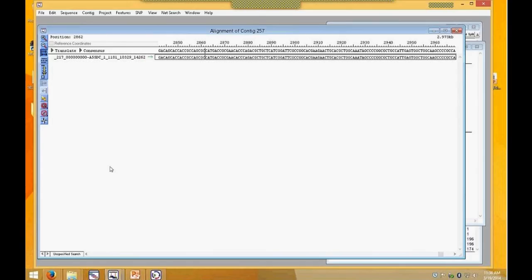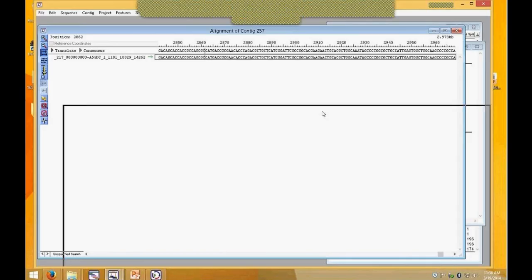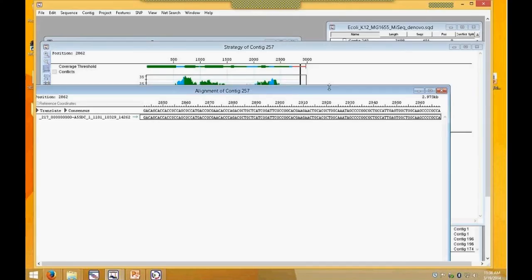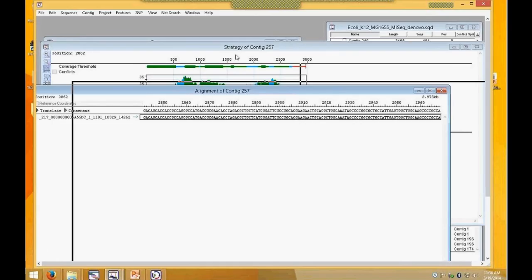And now you'll notice it's taken a little long. This is a pretty strong computer. It took a little longer there than it did with the ABI files. The reason for that is there are many, many more sequences in this contig than there were with the ABI. So something to be aware of is that when you start editing large files with lots of sequences, you might not want to do that on a laptop. You might want a little sturdier desktop so it can do those functions more robustly.